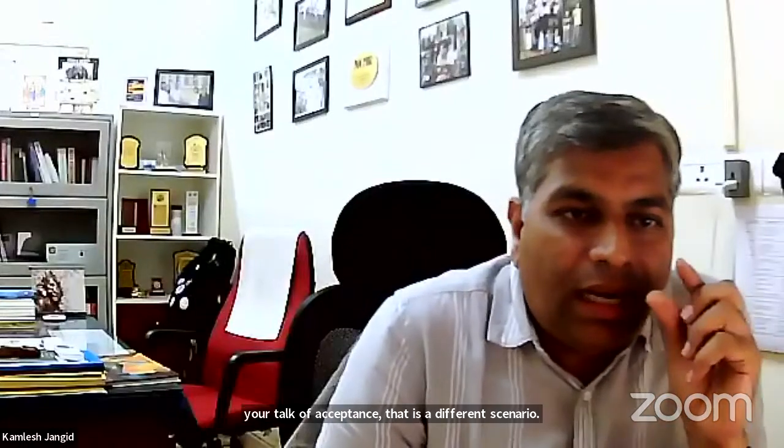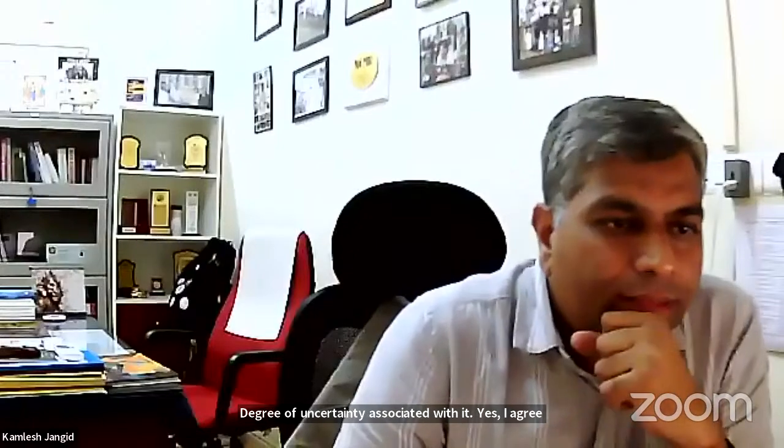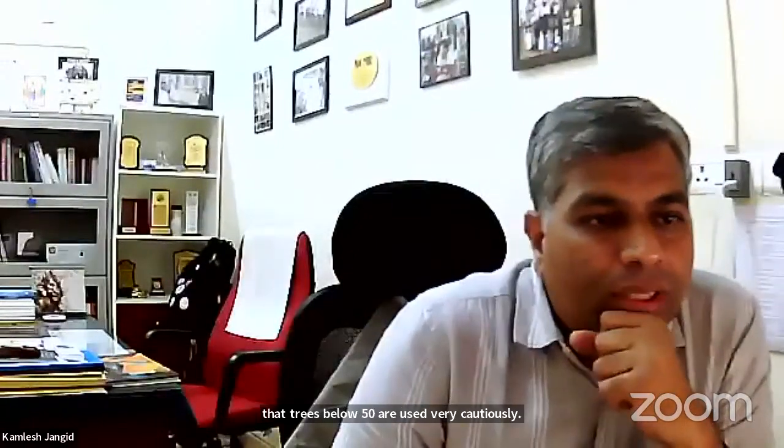Obviously, any value which is above 50 is considered to be better. But it is not that values below 50 are not accepted. If you talk of acceptance, that is a different scenario. But regarding the robustness of a tree and a certain degree of uncertainty associated with it, yes, I agree that trees below 50 are used very cautiously. I hope I'm able to answer that.